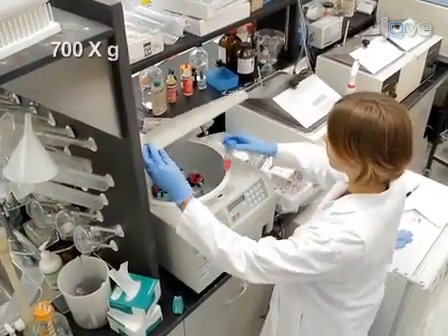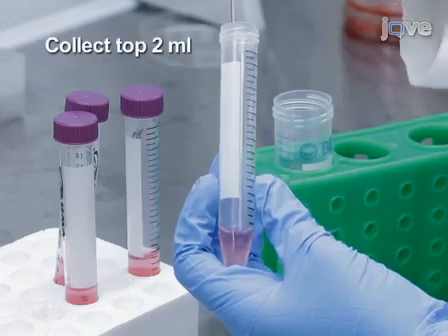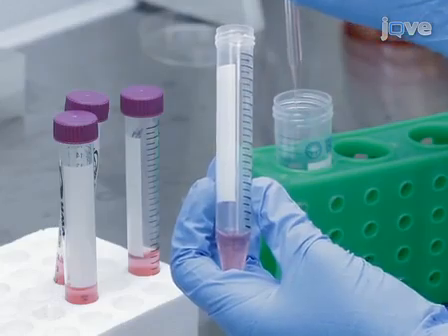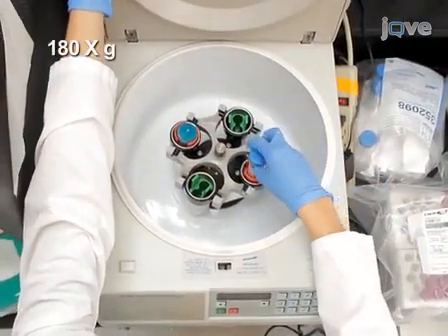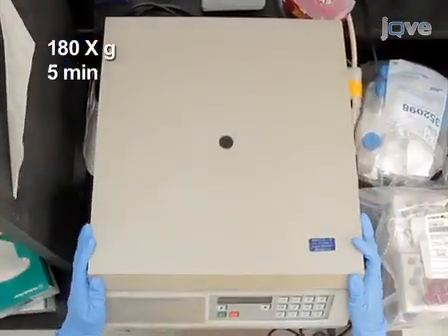Spin the tubes at 700 times gravity for 15 minutes. Carefully collect the top 2 ml from each tube and pool in a 50 ml conical. Fill the conical with L15 and spin at 180 times gravity for 5 minutes to rinse the cells of OptiPrep.